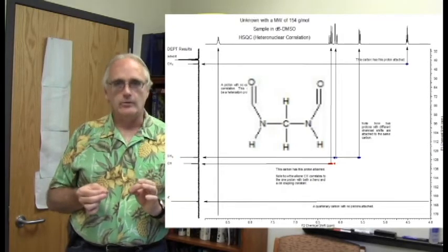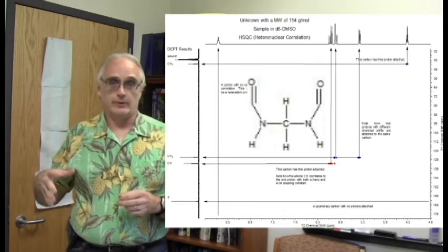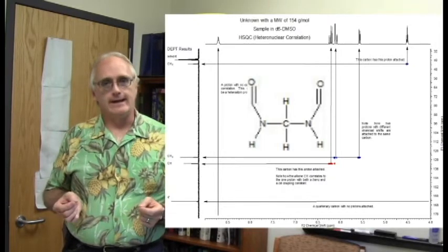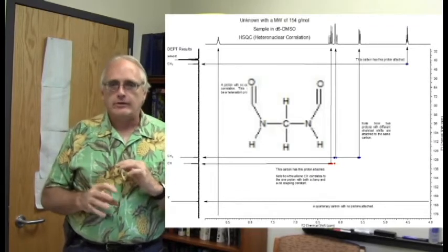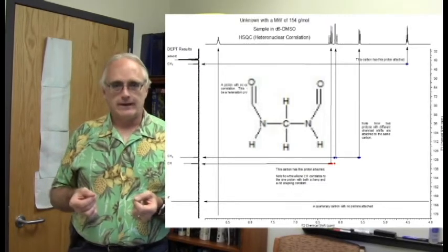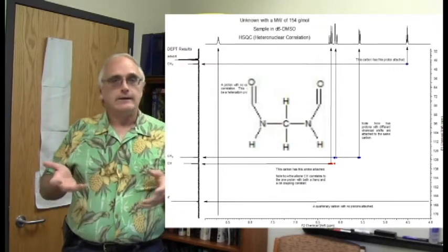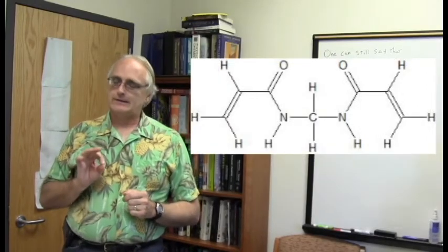The CH2 hydrogens near not 1 but 2 heteroatoms, nitrogens in this case, moving it up from around 4 to all the way around 4.5 ppm. They are triplets because they feature 2 neighboring equivalent protons. It's absolutely stunning when you start putting these pieces together what you can come up with. And in fact, we've already speculated about the terminal alkene and the potential of 2 of those. Now we combine it with the evidence here and we have a viable molecule when you put this whole thing together. And here's the kicker.